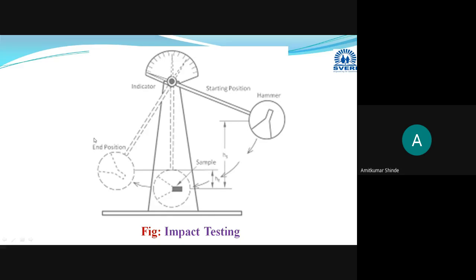Okay, on the free end, it will get subjected to tension. Tension will be created there due to the impact on the free end, as one end is fixed and from the other end impact is created by the hammer. Tension will get created, and the reading we get is the energy lost due to that swinging beam, and that will be termed as the impact strength, or the tensile impact energy.